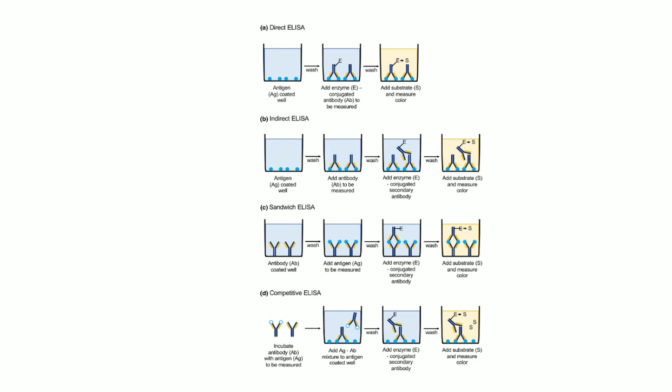We should know the structure of that antibody, because what we add next is this: the antibody which we are going to detect was injected into a goat. So what happens, considering this antibody as an antigen, the goat will produce other antibodies, that is, anti-human immunoglobulins will be produced. So these anti-human immunoglobulins, tagged by an enzyme, are now added.